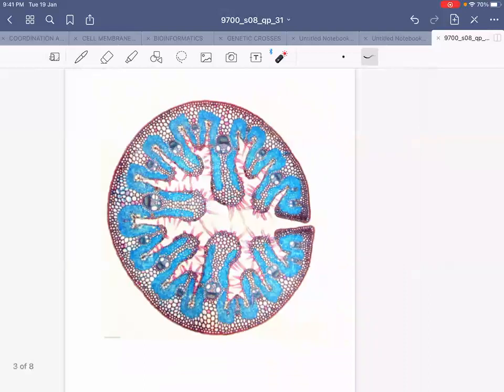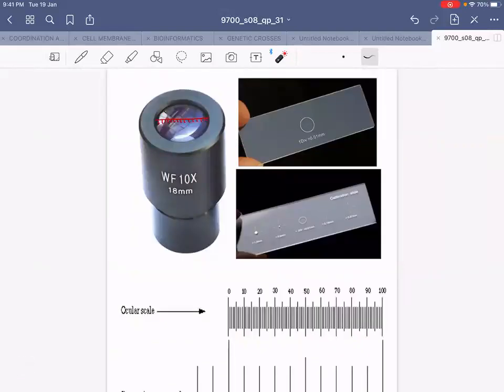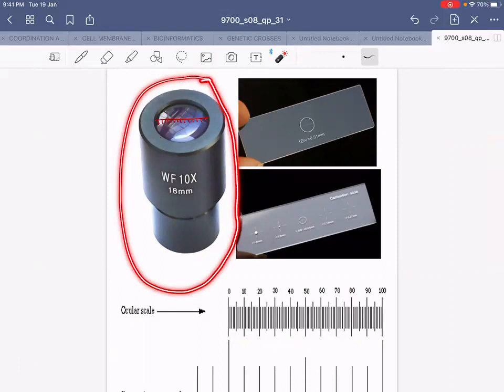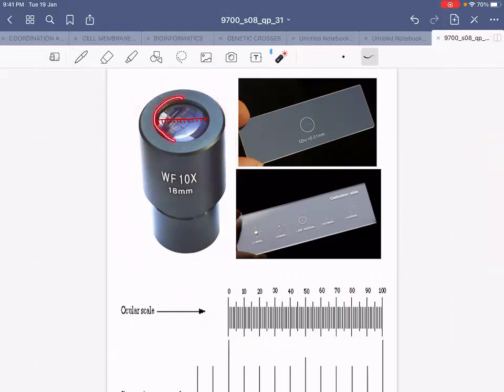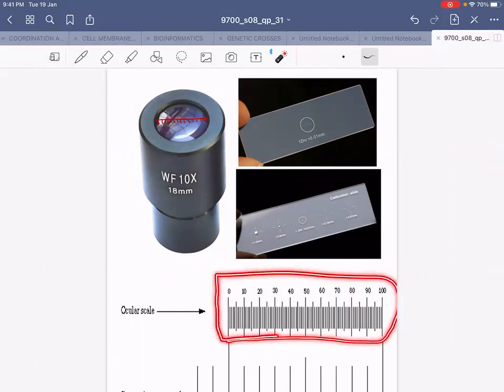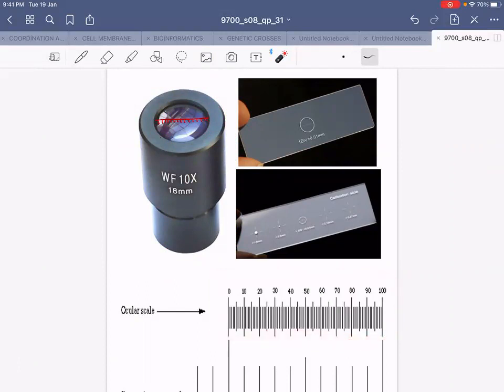Moving on to the eyepiece graticule and the stage micrometer. I'd like to show you how your eyepiece graticule will look like. On each table you have been provided with a special eyepiece lens called the eyepiece graticule. We call it a graticule because this lens is special — if you look at it carefully it is calibrated. Usually eyepiece graticules are calibrated with 100 divisions.